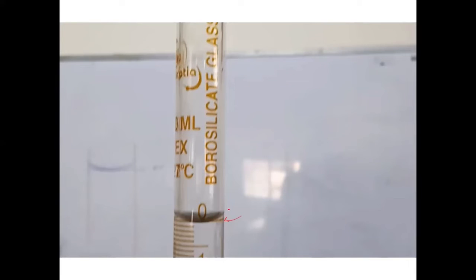And see, there are two meniscus, the upper meniscus and the lower meniscus. So we always fill it by observing the lower meniscus.